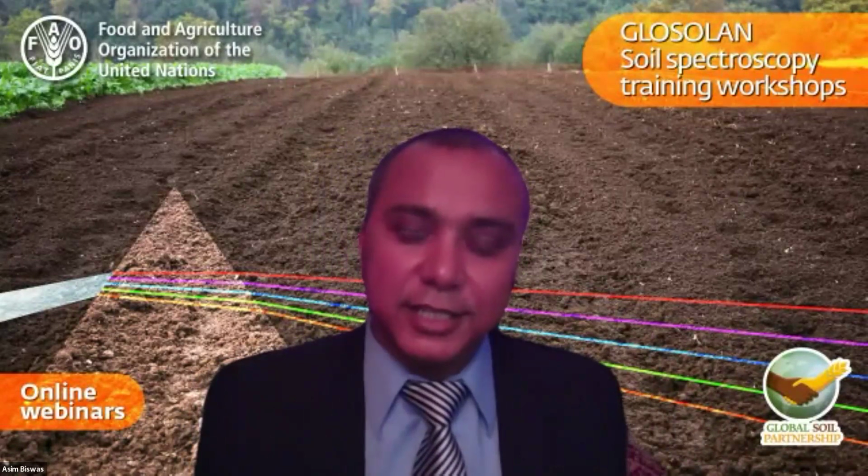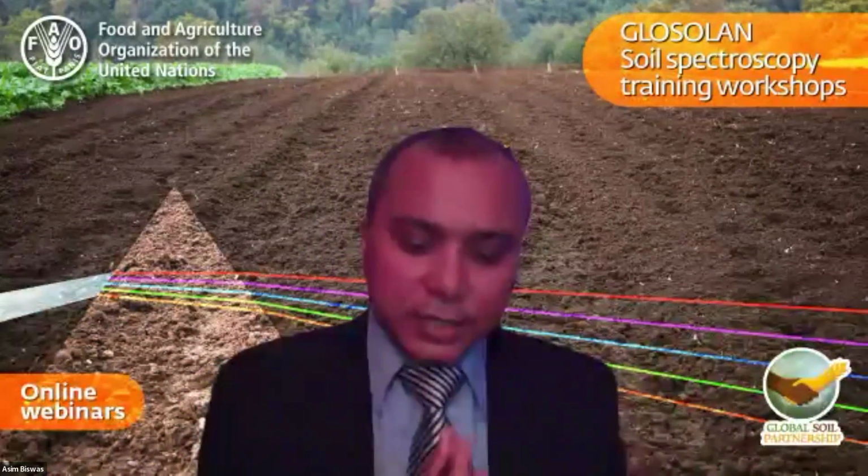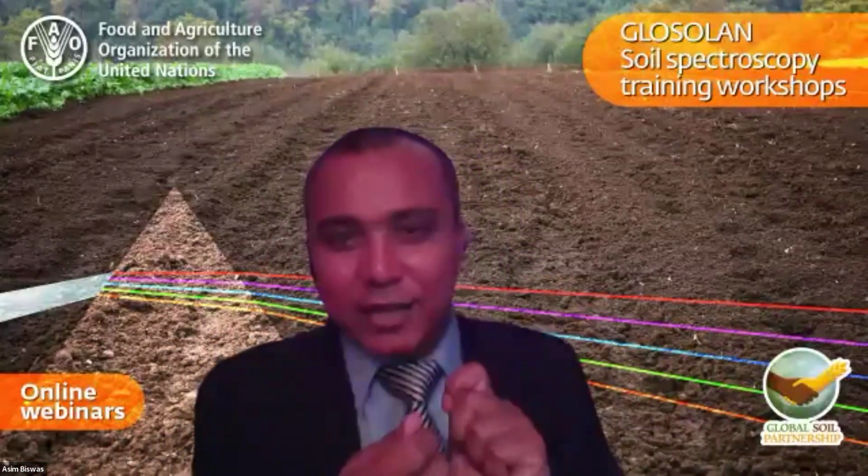So in this particular way, if you want to explain how DS is fundamentally working, DS is really looking at the difference as a whole spectrum, the whole spectrum within the wavelength range you have collected. It looks at the variation, and that variation, the EPO, when you're looking at it almost segment by segment, is looking at how those variations are coming and trying to predict those variations, how much of a change could come in here and how much that change could contribute to the modeling as well. That means we want to create the transformation matrix, how we can tune that field spectra using that modified approach and try to come as close as possible to the dry spectra as well.